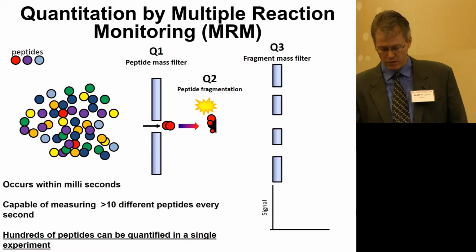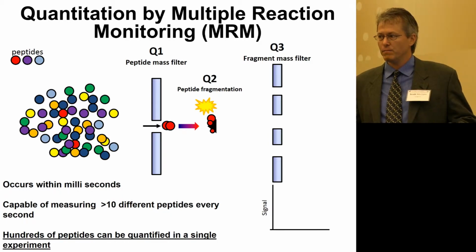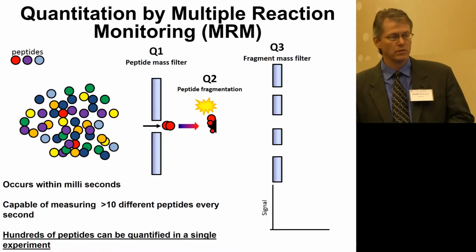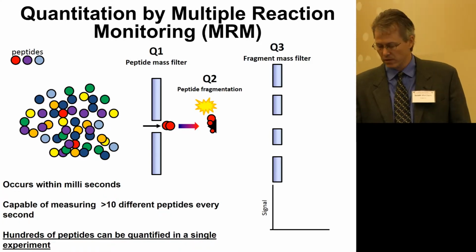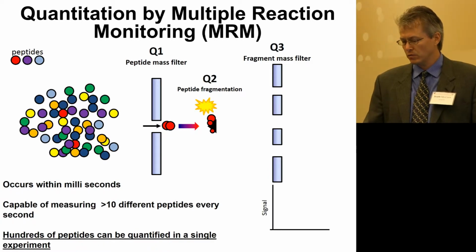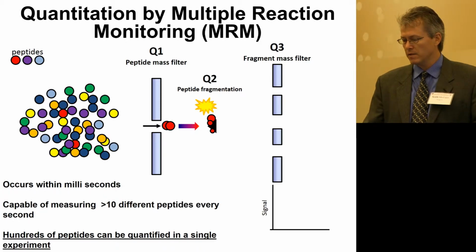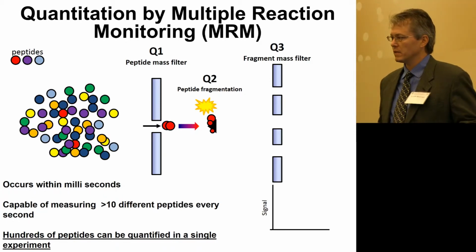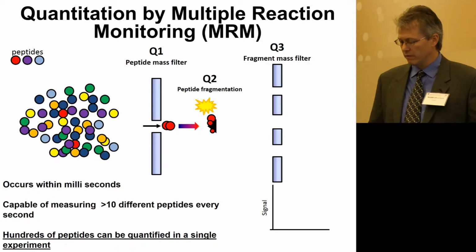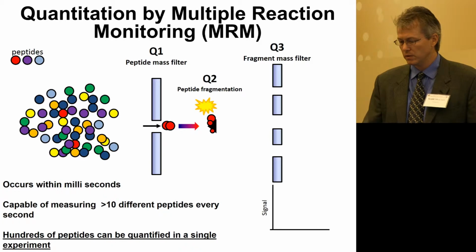But anyway, the concept here is you do not want broad spectrum-based proteomics. You actually know what you're looking for, and so it's targeted in that sense. And so if these are it, they're going to go through a peptide mass filter. You're going to let certain ones in or pay attention to certain ones. And so they're filtered, so only the desired peptide is analyzed. There's really too many peptides, obviously, in a complex seed matrix to look at all of them. But because it is mass spectrometry, you can pay attention to only certain ones.